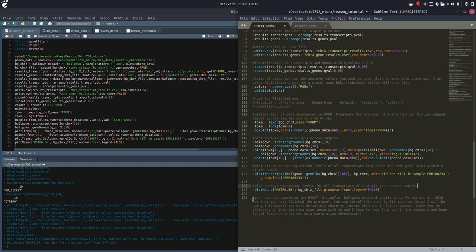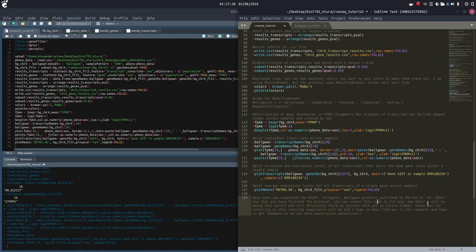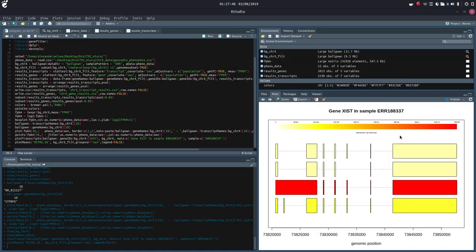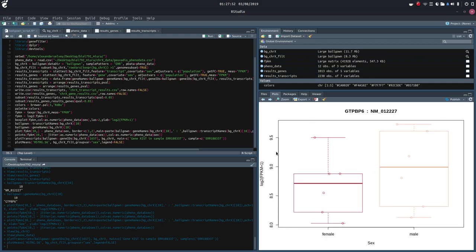I threw in a nice little piece of encouragement. You have now completed the HiSat StringTie Ballgown protocol published by Pertea et al. 2016. Now that you've finished the protocol, you can retool this code to fit your own data. I will actually be doing this myself with some real data I haven't even analyzed yet, and I hope to bring you guys on that journey and make some future videos of this process. I thank you for venturing with me on this learning experience, and I hope to hear from you in the comments.